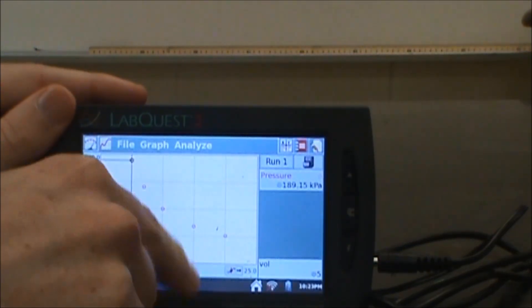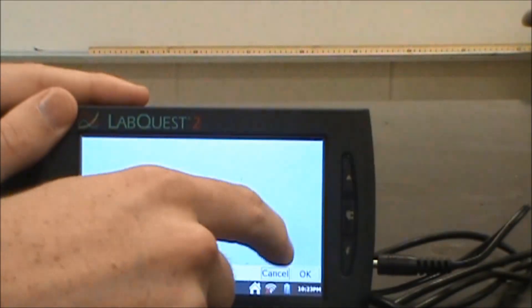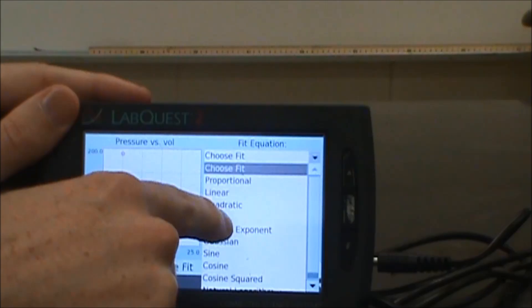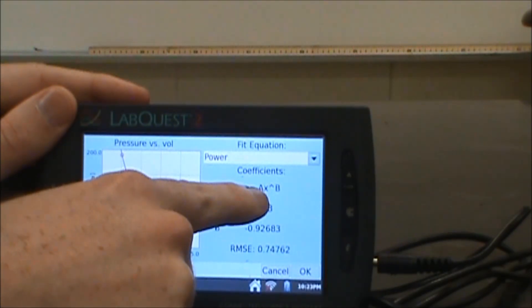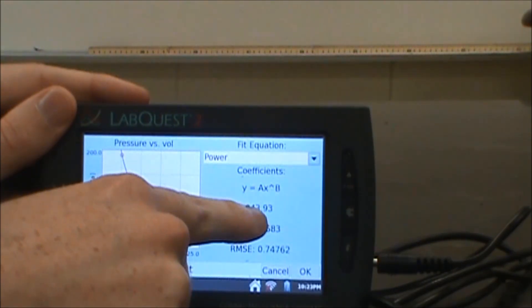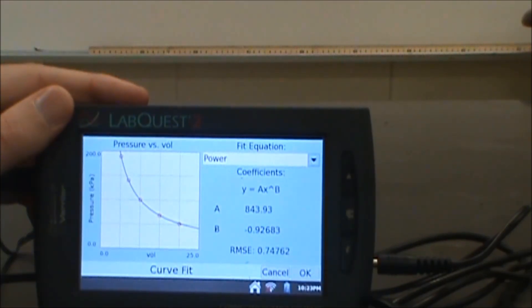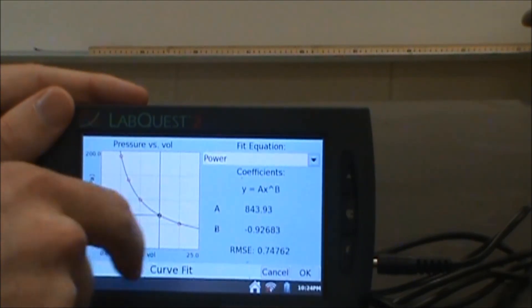Let's go ahead and take that. You hit stop. If you want to go to analyze, you can go to curve fit. Select your graph. For this one, I'm going to go to power. That gives me a x to the b power. So I have 843.93 x to this power negative 0.92683. That's the curve that fits that data.